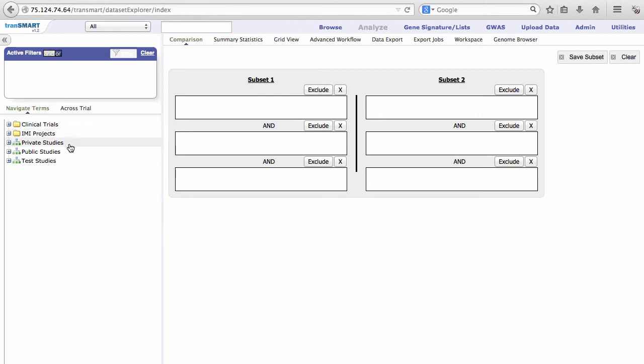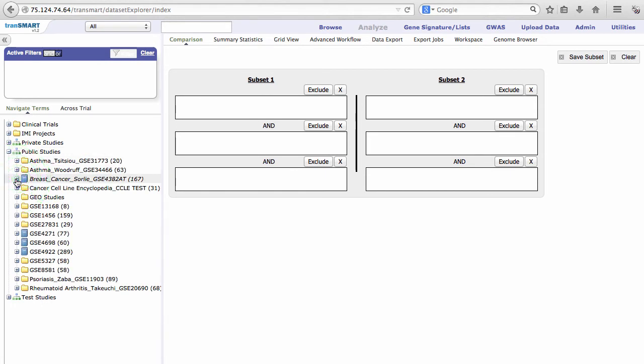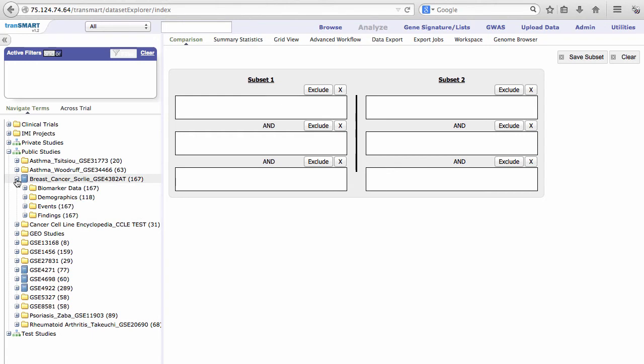In the left pane, expand the Public Studies folder. Then expand the Breast Cancer Study by Sorley. In the Public Instance of v1.2, you'll notice that the Public Studies are organized with a slightly different structure than they had in the Public Instance of v1.1.